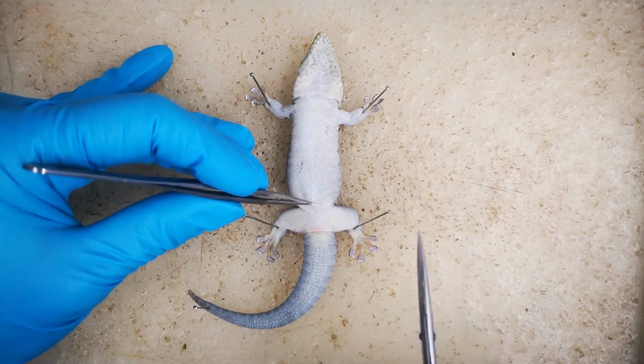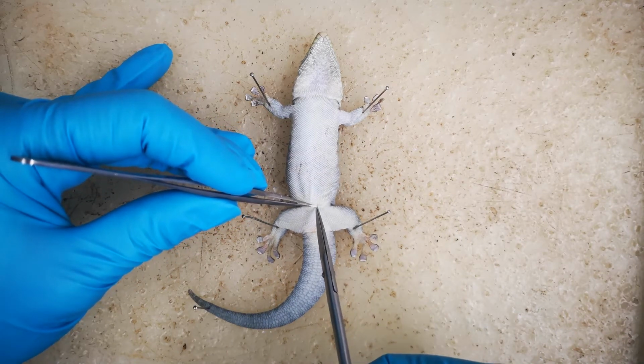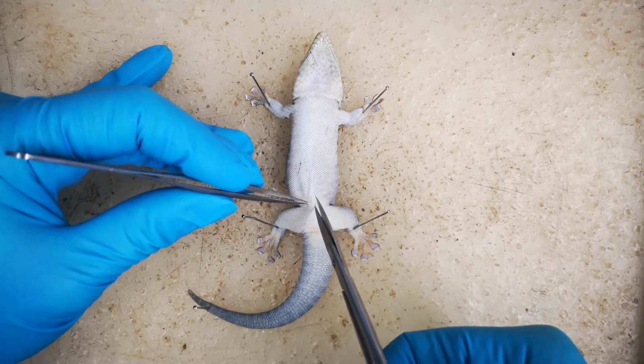To dissect the specimen, we make a sagittal incision running from the posterior abdomen to the pectoral region, or chin.